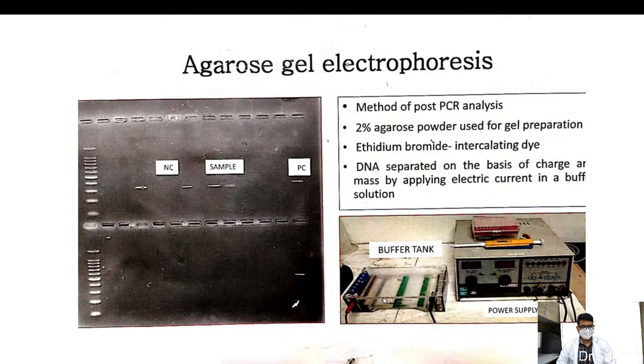Ladder is a reference where we have already mapped the mass of the target DNA of interest. This is used for matching. So we can see whether our desired mass, if you are detecting a pathogen, according to the mass charge ratio, if this is the location, if the DNA can move to this location, by referring to this ladder, we can diagnose that our amplified product is significant.